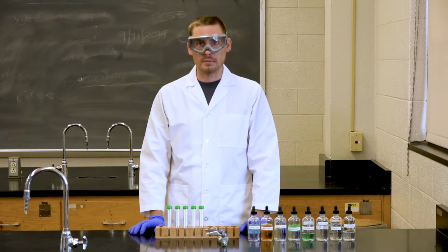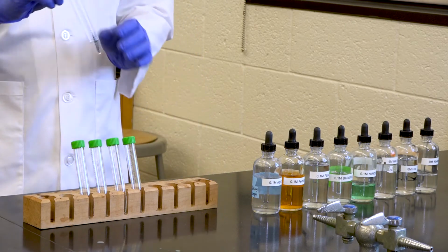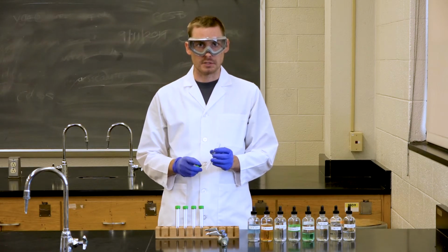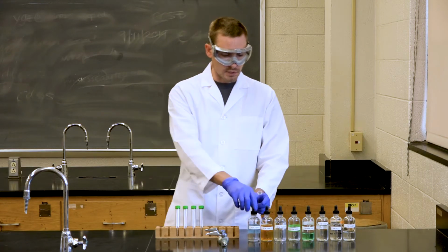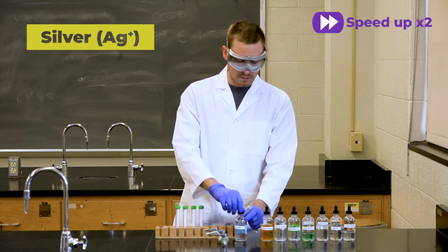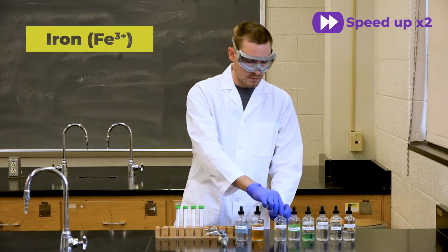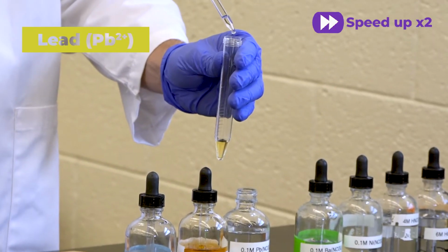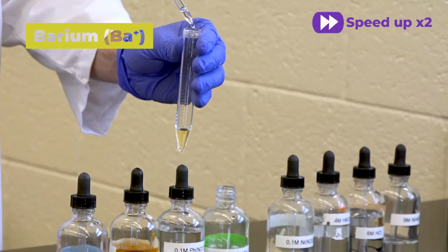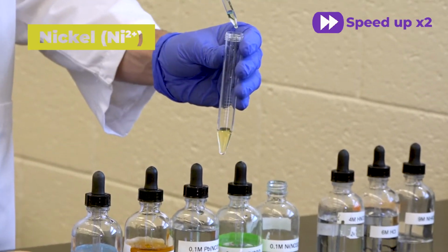Next, we will make a mixture of the 5 ions that we are using today into one test tube. So to do so, we're going to add about 5 drops of each metal nitrate solution into this test tube. We'll start first with silver nitrate. Next, we'll add iron nitrate, and lead nitrate, barium nitrate, and finally, nickel nitrate.